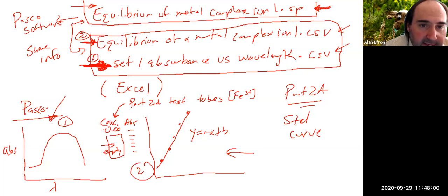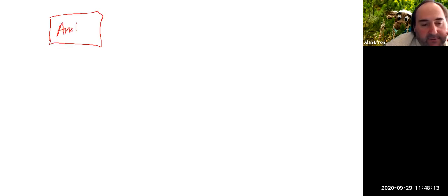And in terms of the Pasco software, where you can find those 2 graphs, just to make sure, when you look at the very top, there should be a box that says Analyze Solution. And then there should be a box next to it that says Concentration, right? And one that says time, I think, with it as well.